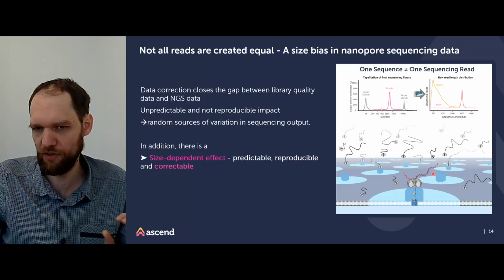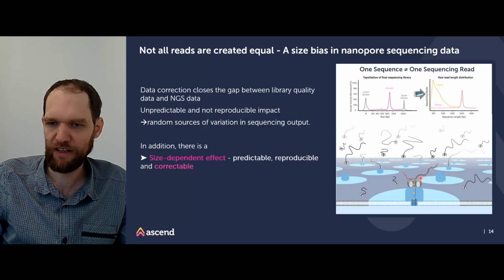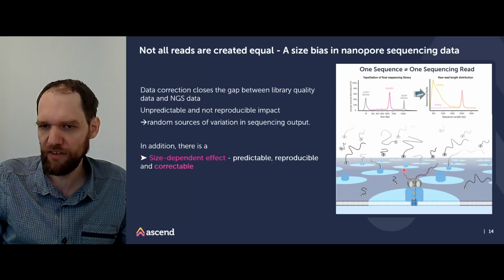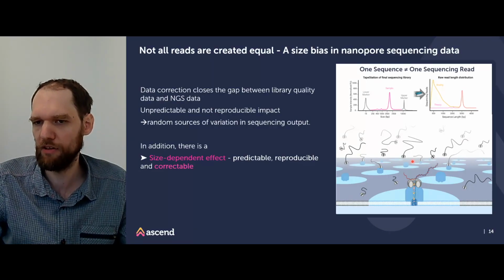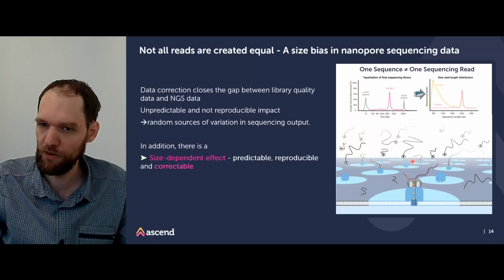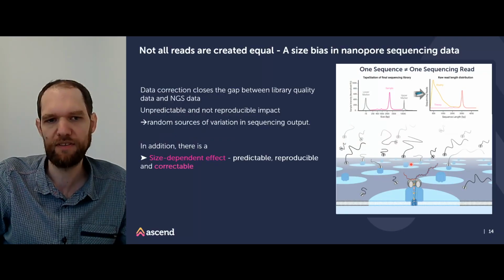And we know that during a run, the flow cell is exhausted much faster than all DNA pieces to be sequenced. This we know because we can recover the library and load it on a fresh flow cell, and we get a lot of new information. So it means only a fraction of the reads gets really sequenced.